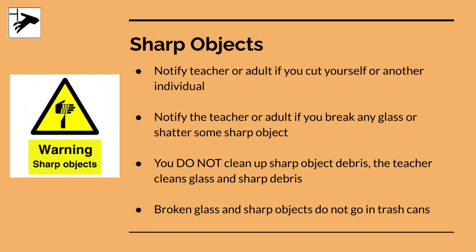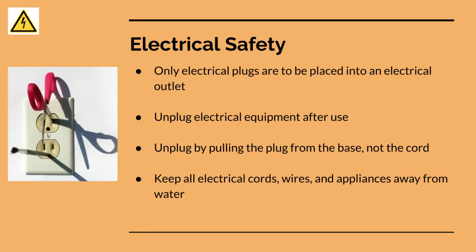Again, I don't want you to touch that broken glass. I'm the one who picks it up. Okay. All right, electrical safety. So only electrical plugs are to be placed in electrical outlets. This is very much like what you do at home. Only electrical plugs go in electrical outlets. Don't stick forks, don't stick scissors, whatever it is. That's silly, that's dangerous, and you will hurt yourself, okay?